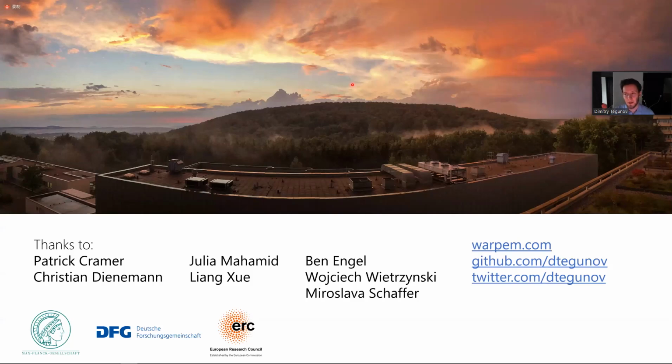But this is also because we fractionate the dose very coarsely. And you may have seen a preprint from John Rubinstein's lab a few days ago, where they propose a new file format that lets you fractionate the dose much more finely with Falcon cameras. And for tilt series data, the most significant misalignments are just global translation and rotation. Everything else gives you maybe an extra, I don't know, 10 to 20%.